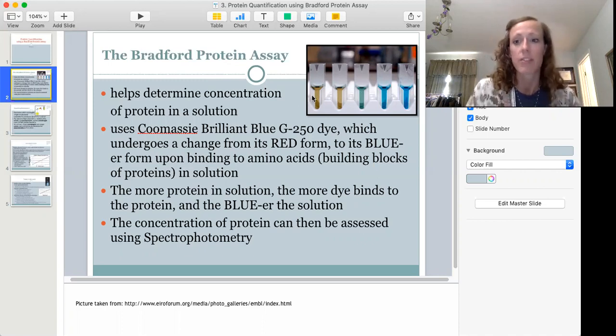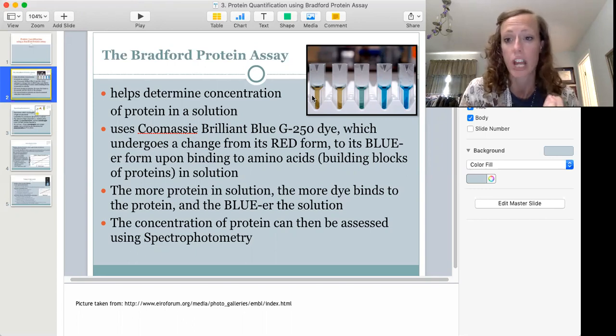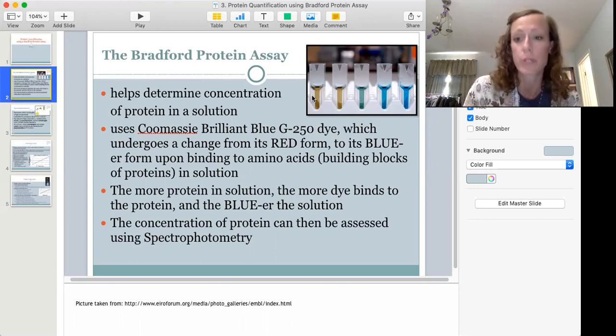Now if instead you have water that has protein in it, then when you add that dye, the proteins will be bound. Some of the amino acids in the protein will be bound by the dye, which then undergoes a change to a bluer shade, a bluer color. So that's why you're seeing these cuvettes on the right hand side with a nice vibrant blue color.